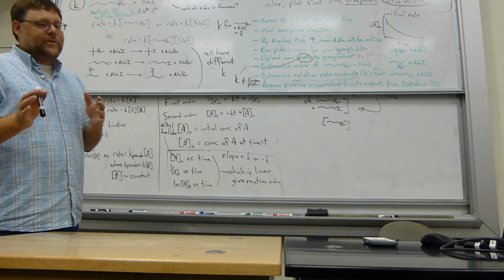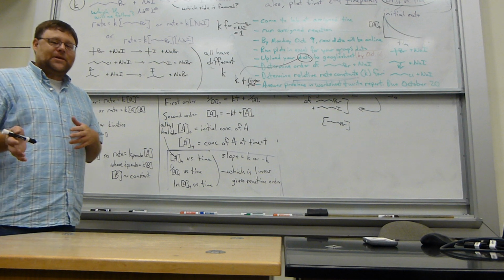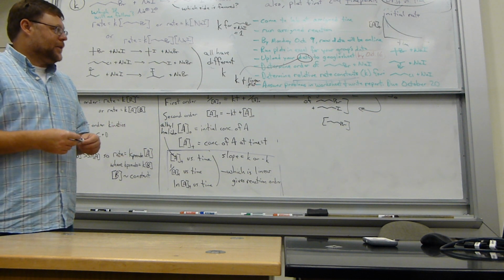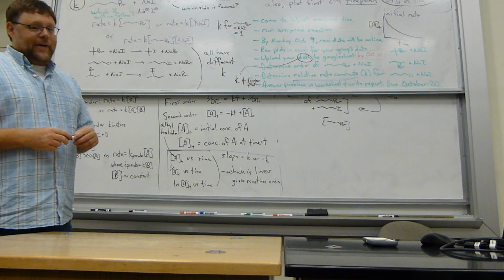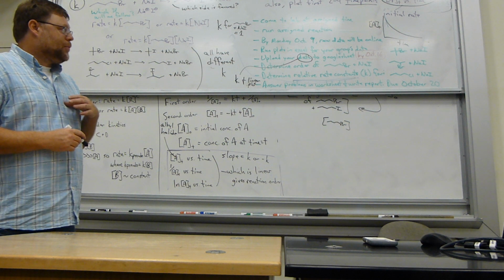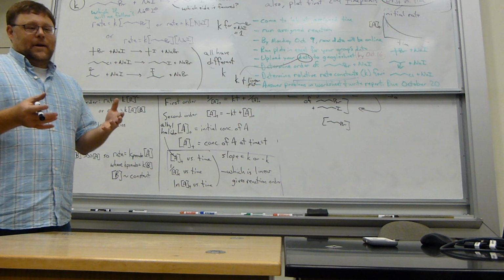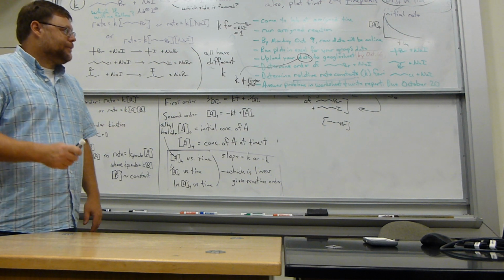And then Natalia and I, and the reason Natalia and I are processing the data is it's specific software. We'd have to teach you how to use the software. It changes every couple of years. There's no reason for you to learn the software at this point. So we'll get the raw data out. She and I can do that pretty fast. We'll plot that, we'll upload that to Google Sheets, and then you guys will play with the data. And playing with the data is a lot of what science is.